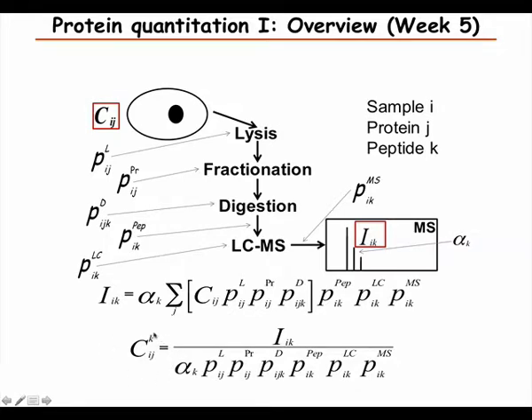And of course, this has to be tested, so that we make sure that this is within the linear range, because at very low amounts we go below the detection limit and won't be able to detect anymore, and at very high amounts we can get saturation. But usually the assumption is that we're operating within the linear range, which then gives you this proportionality.